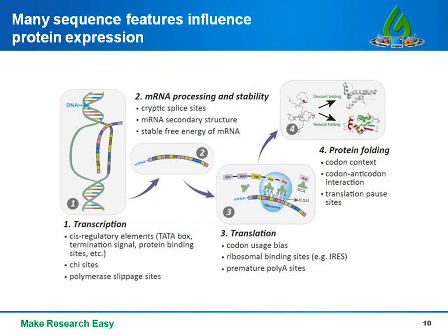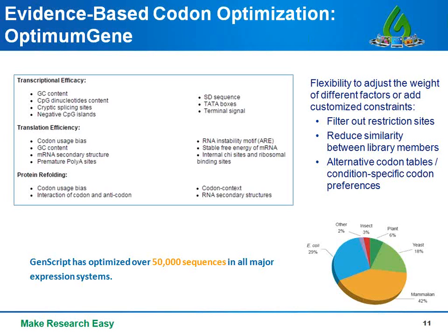So there have been many other studies that have identified other sequence features that affect protein expression through diverse mechanisms at different stages of the process, from transcription to mRNA processing and stability to translation initiation and elongation and protein folding. Now, in many cases, the practical implication of these studies is simply that we need to design DNA sequences to not contain certain sequences that have been revealed to cause problems, such as the SD-like sequences we just discussed, or AT-rich sequences that can cause premature transcriptional termination, or there are specific 7-nucleotide sequences that are known to introduce frame shift mutations, etc.